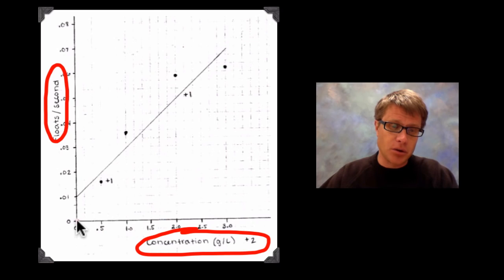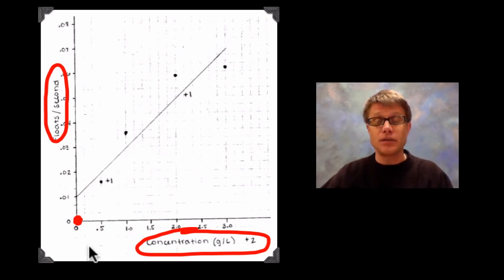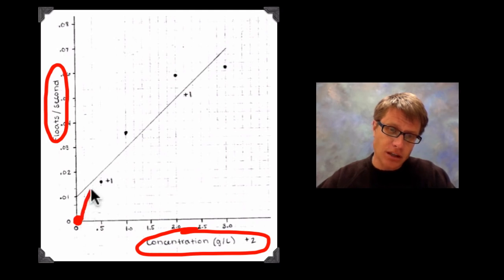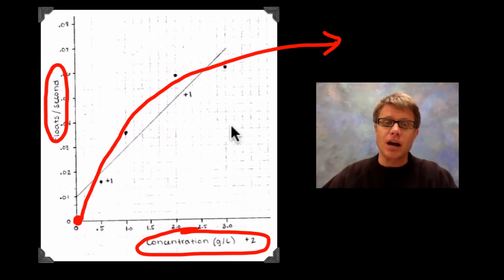And so again, if we put it in there with no yeast, what's going to be the rate? Well, it will never ever float. So if we take one float divided by infinite time, that's going to have a rate of 0. But you can see on here that basically what we're going to get is a curve that looks something like that. And so if I were to extrapolate a little bit, it's going to eventually go all the way out like that.